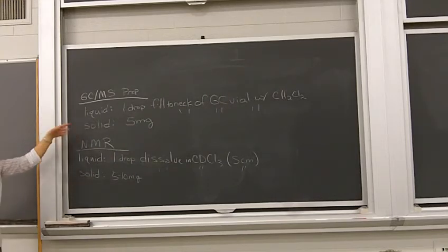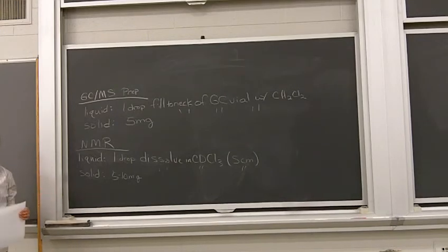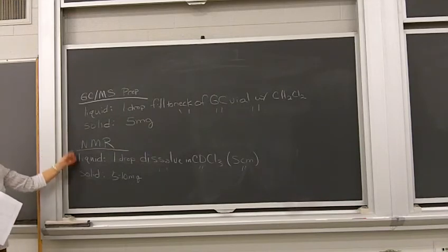For both of these, there are sample blocks to put your samples in, and then also, if you remember the sheets from last semester where you put your name and your sample ID for submitting the sample, the same thing will go for both of these, okay?